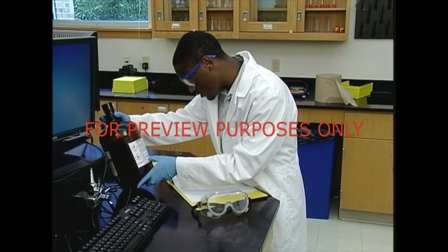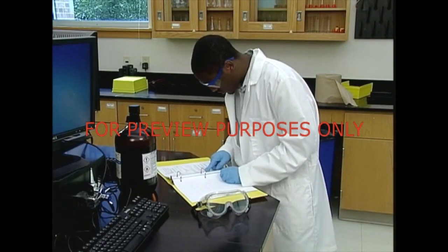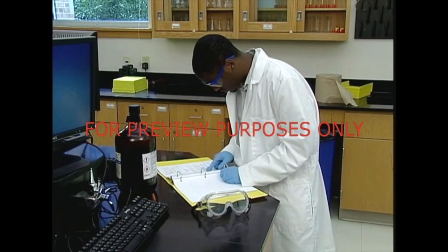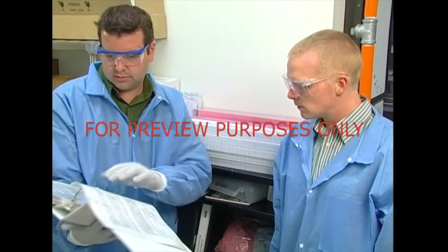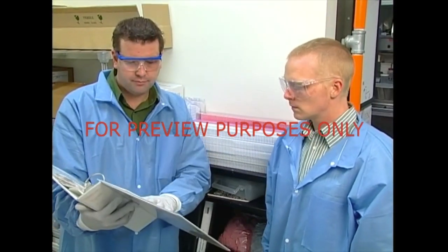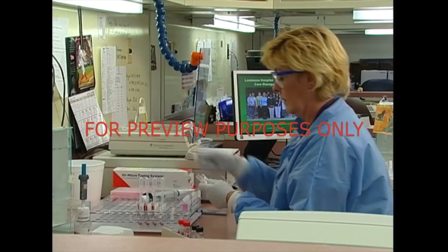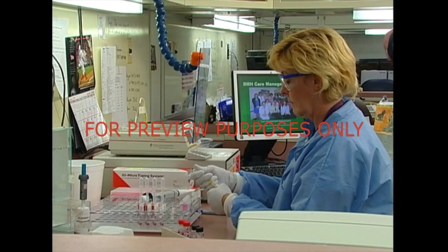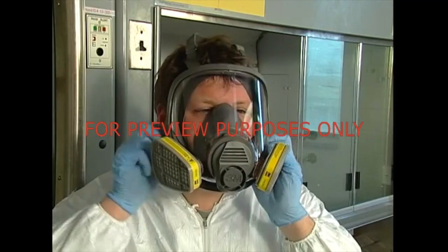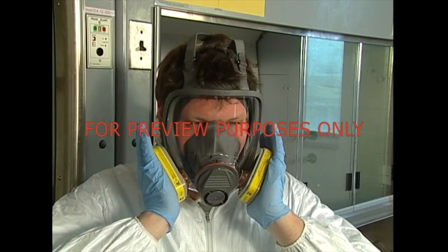You need to learn about safety data sheets, SDSs, which describe a substance's ingredients, properties, and hazards. And there's your facility's chemical hygiene plan, which explains how to work with the chemicals in your lab safely. In fact, there are plans covering all types of hazards, including biologically infectious materials. You may read about things such as RCRA, lockout, tagout, and respiratory protection.